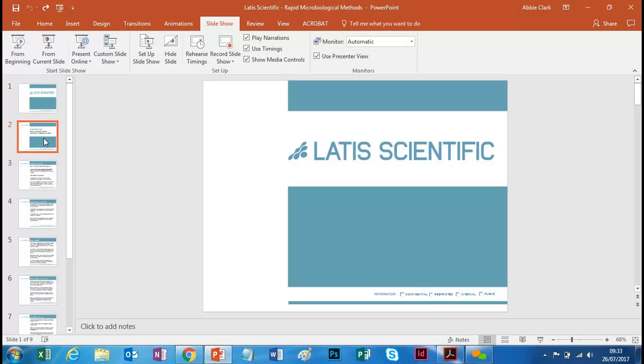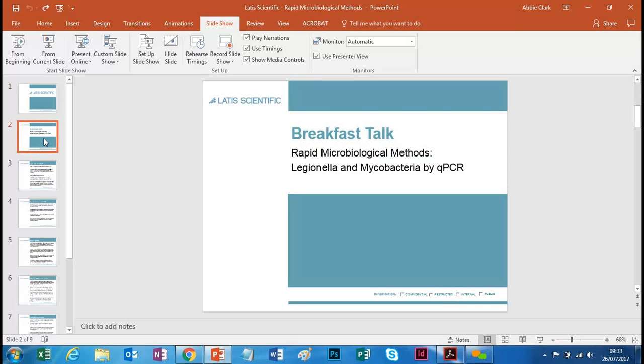So this morning I'm going to talk about rapid microbiological methods, and more specifically Legionella and Mycobacteria determination by quantitative polymerase chain reaction, or qPCR.